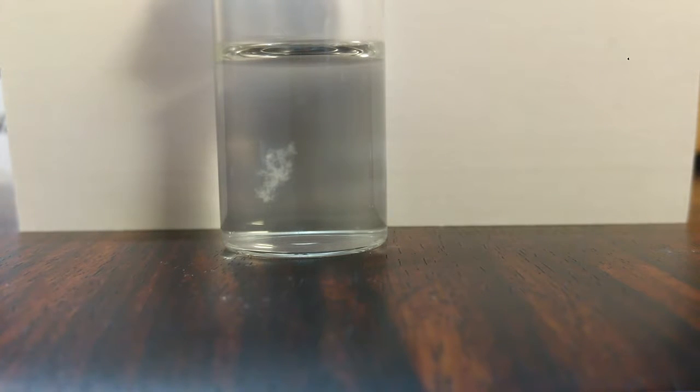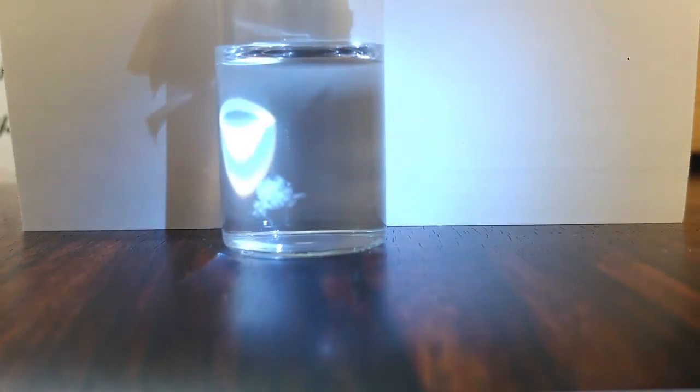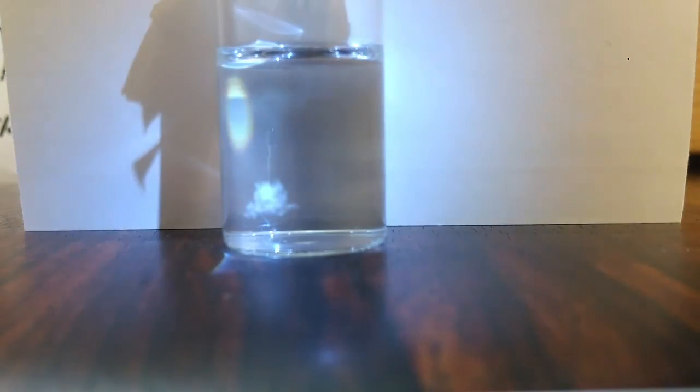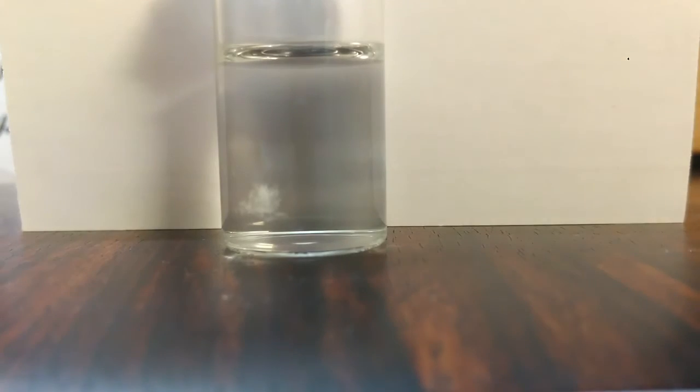And like I said last week, I speculated that one of the problems was that I had 2 layers of Kim wipes on my vial instead of 1, and I changed that, and it definitely did speed up the process of evaporation, but it just doesn't seem like any crystals are growing. I'm assuming that this white substance in here that looks like saliva or white mold or white snowflakes in water is just the middle process of becoming alum crystals.